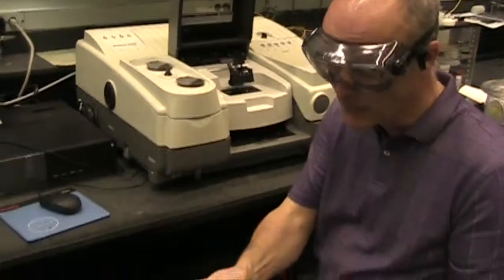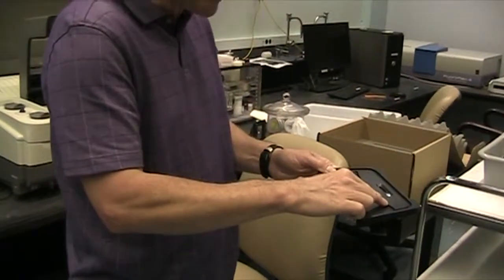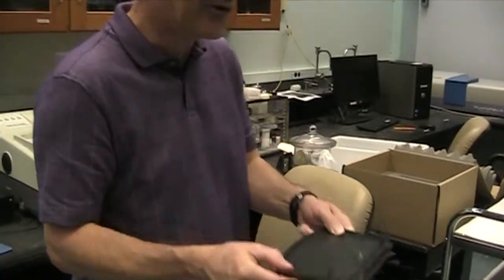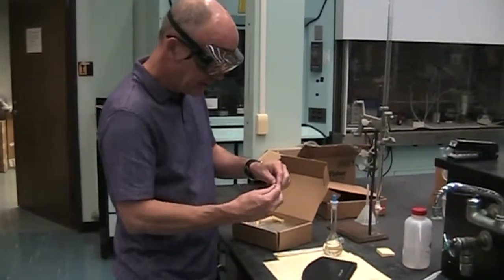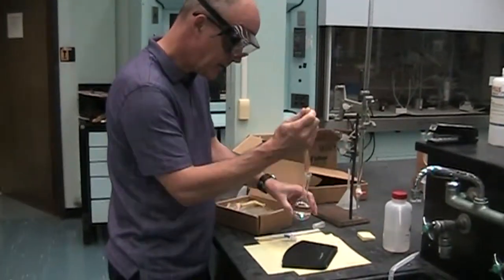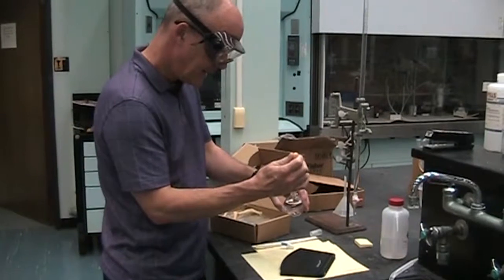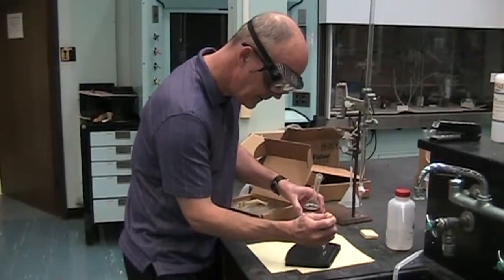You can take the plate out or leave it in position, but all I'm going to do is put some droplets of the liquid into the trough. This is the aqueous ethanol solution, so no real safety hazards associated with this sample. And just going to add enough drops to completely cover the crystal.